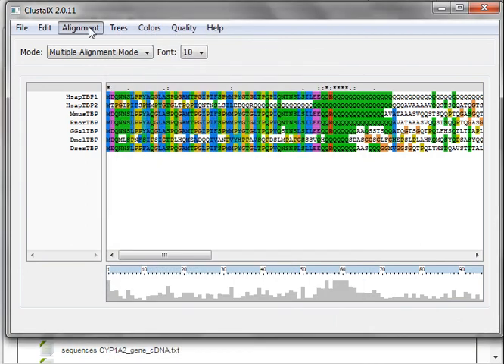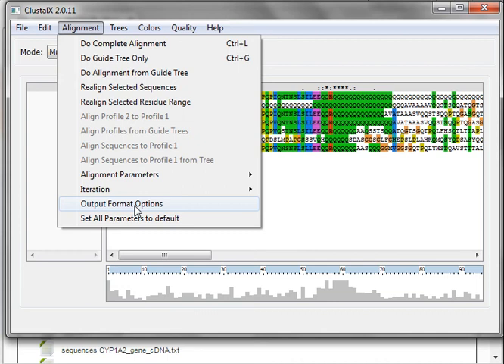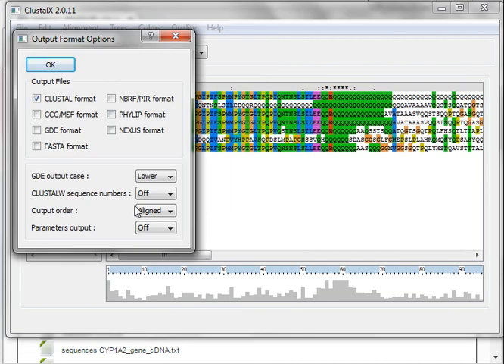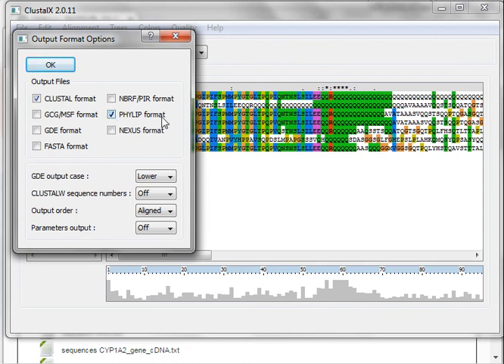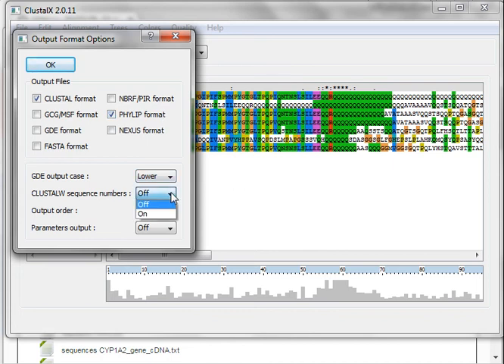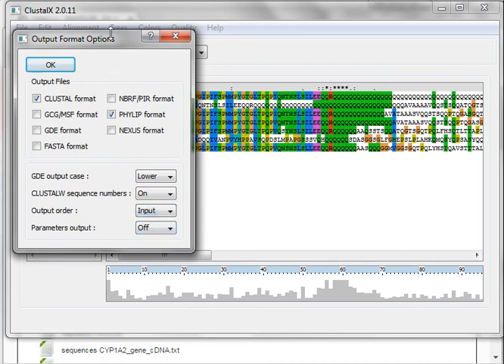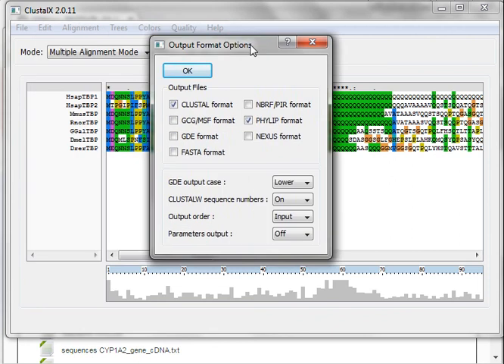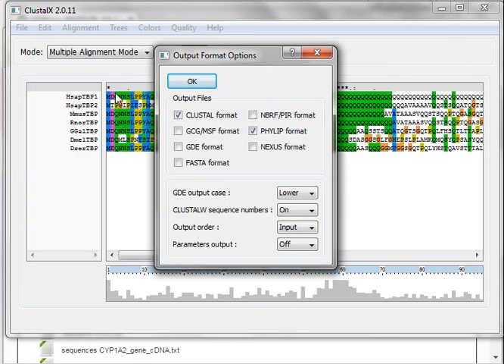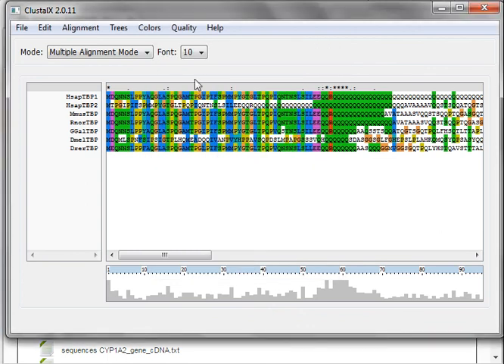And then you can also select the output format. The output format is always by default selected Clustal style. Once you want to continue and proceed to phylogeny, you must select PHYLIP format because the software you will use here to perform the phylogeny called MEGA, you will need as input a PHYLIP format. Now you can also add the sequence numbers and the output order can be the aligned or the input. The input is keeping your human sequences on the top. Then you say OK.